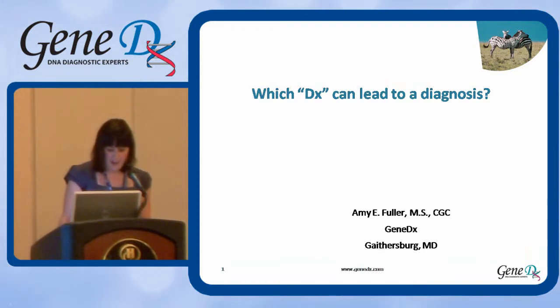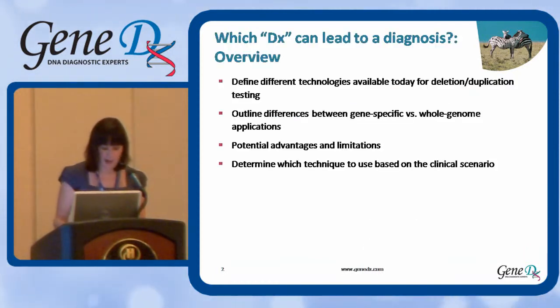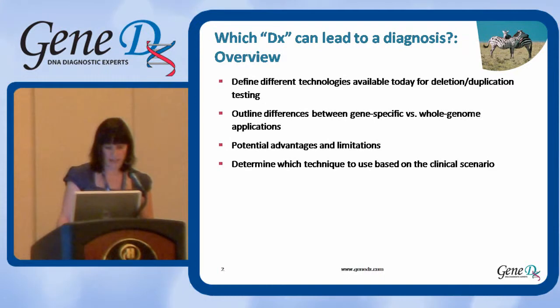By the end of this talk today, I hope to outline the different deletion duplication testing methods available today and discuss the advantages and limitations of each different technique. I'll divide the talk between genome-wide applications and gene-specific techniques and use case examples to highlight their differences.